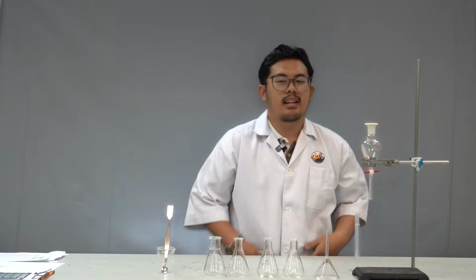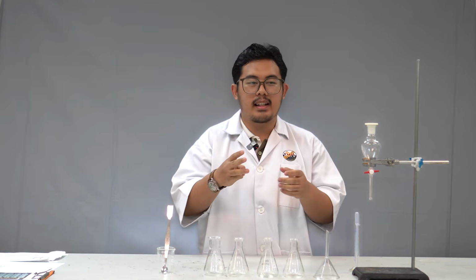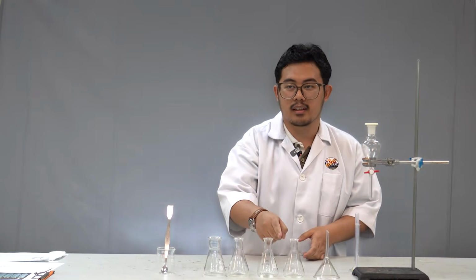So now I'll be telling the story of how we ran our experiment. I'll be separating them into three stages. Stage number 1, preparing the mixture. But first, we need to have ready 3 labeled beakers, each labeled acid, base, and neutral.